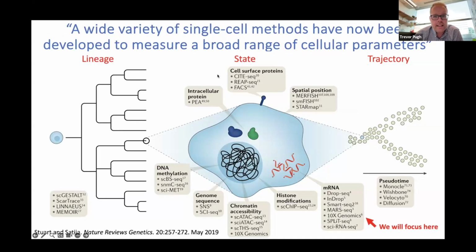I put the title of this slide in quotes. It is actually a quote directly out of this really well-aging review. So this is a review of all the single cell technologies back in 2019. It actually hasn't changed very much since then. Technology kind of took off, and now it's more iterations on these core sets of technologies.